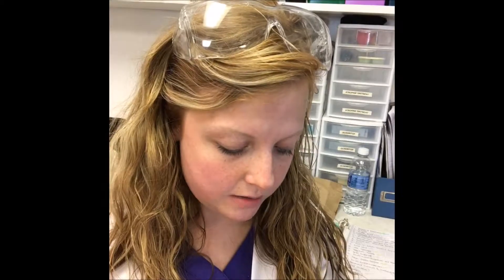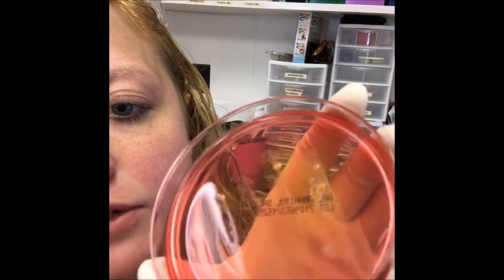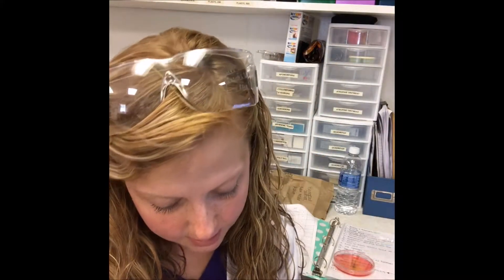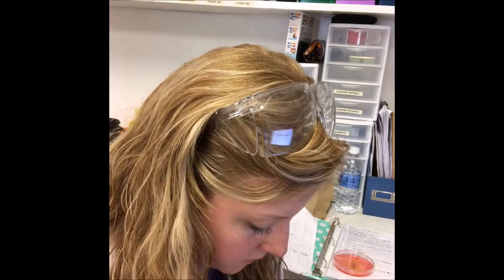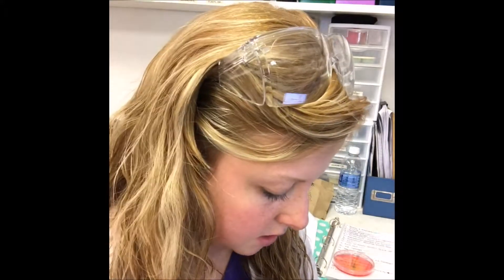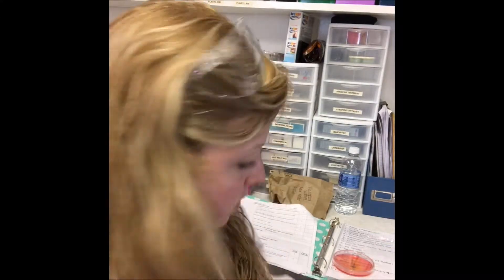The bacterial culture has been sitting for 24 hours. I'm going to take the lid off so you can see all the growth. You can see the bacterial growth pretty well. I have antibacterial discs — ampicillin, erythromycin, penicillin, and neomycin. I'm going to use one of each and add them to the colony growth to see what happens. I'll place the penicillin disc on one colony, then erythromycin, then ampicillin.